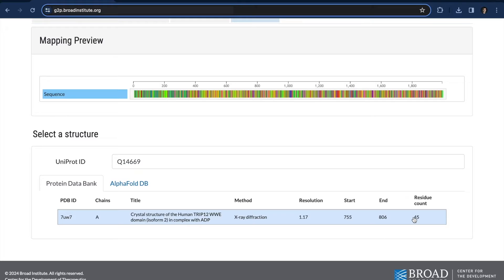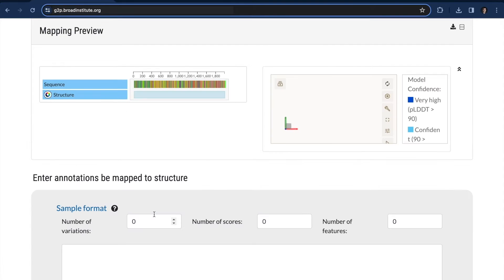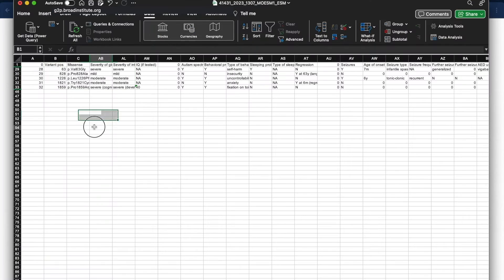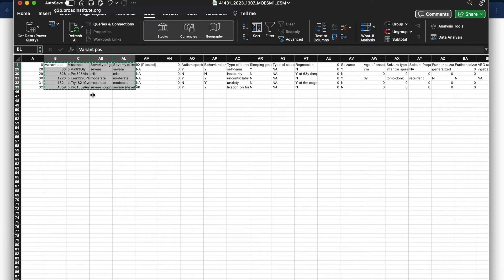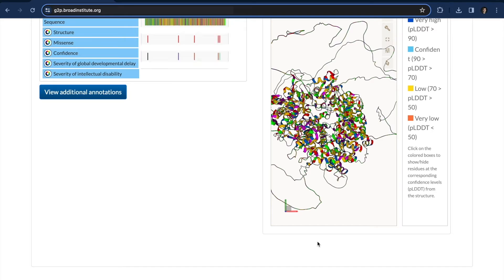TRIP12 has about 2,000 amino acids, so this structure is covering less than 5% of that total. Instead, I'm going to go and select the AlphaFold structure. Next, I'm copying the variant data over, and we're ready to analyze.